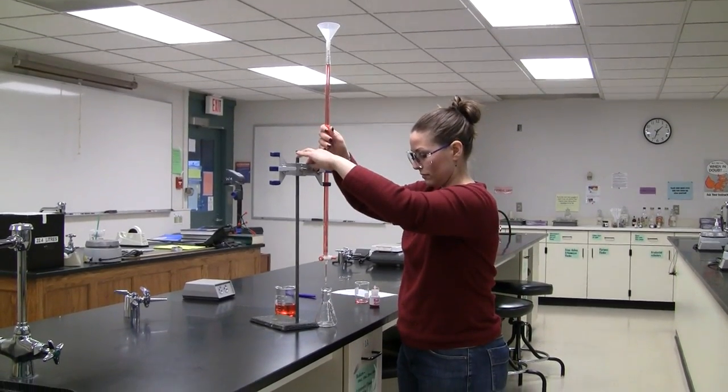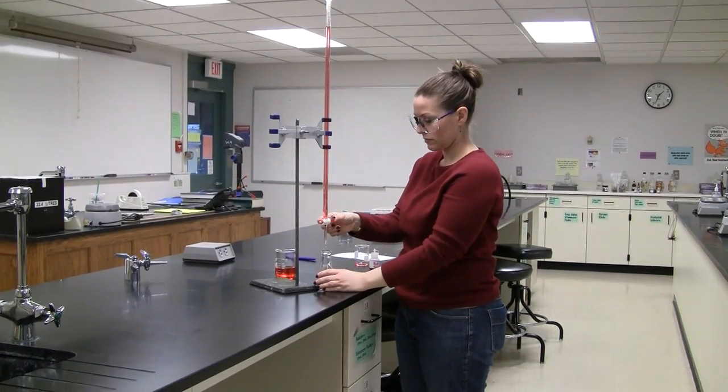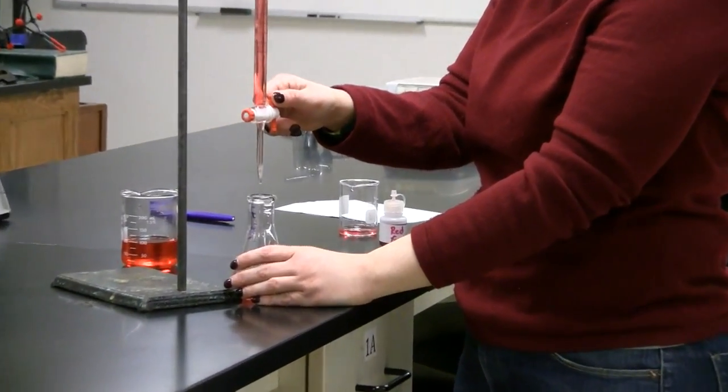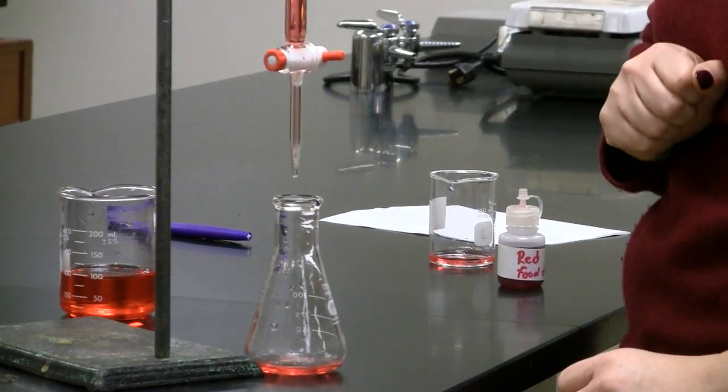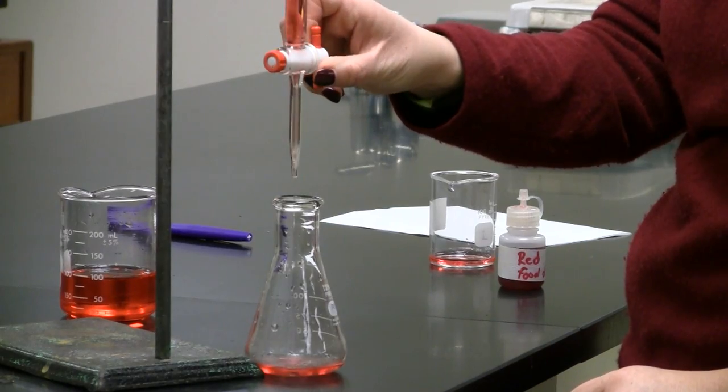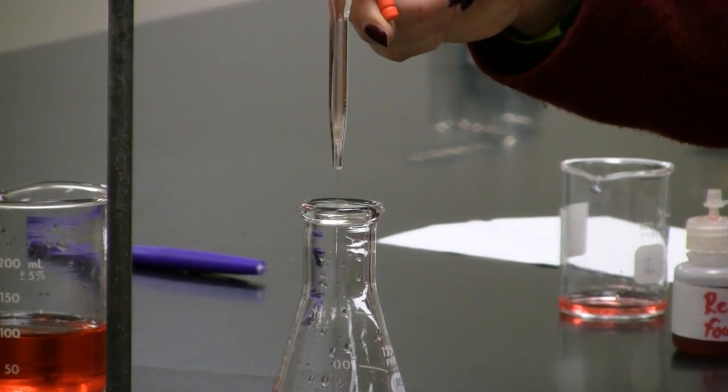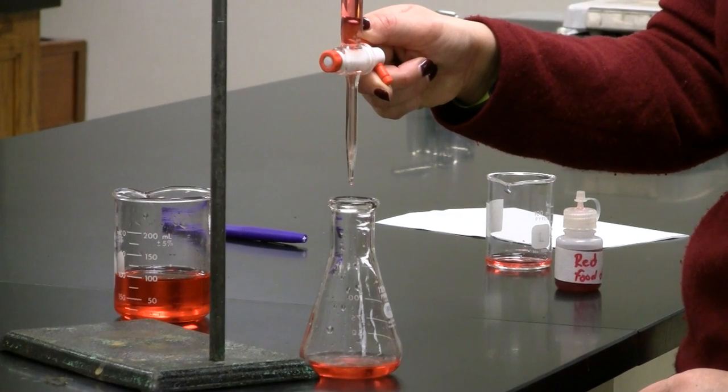The flow of liquid out of a burette is controlled with a stopcock. Turning the stopcock fully perpendicular to the burette stops the flow of liquid. Fully parallel allows maximum flow. By carefully adjusting the stopcock, you can dispense liquid at full speed, more slowly, or even dropwise.